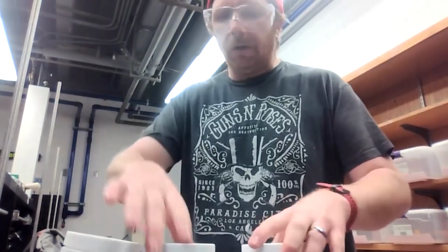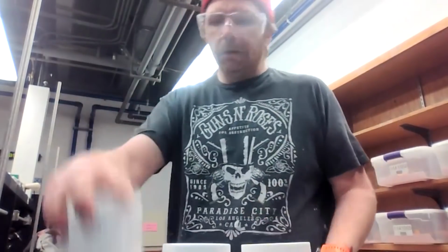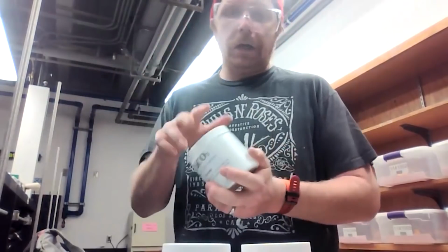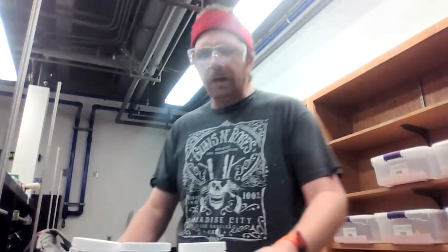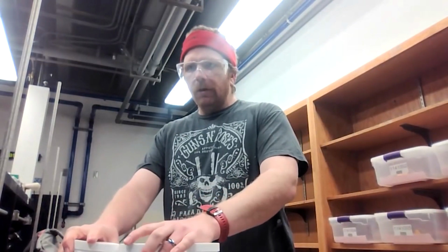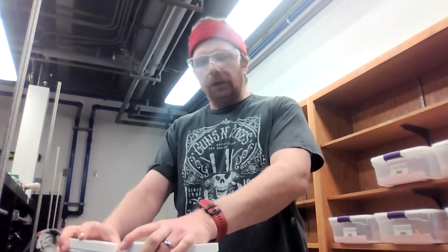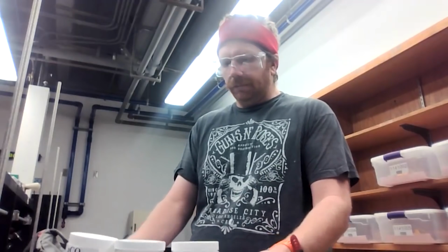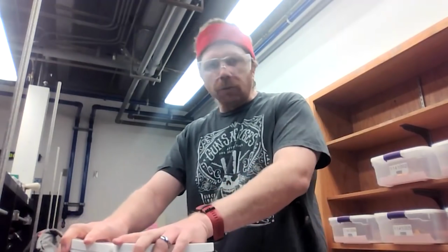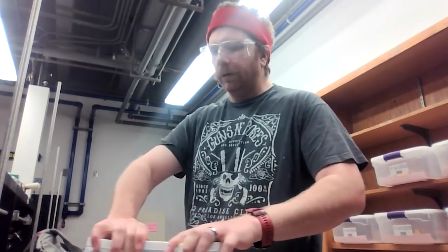They all have the same appearance, but if you were in the lab, you'd be able to recognize that these have slightly different densities. What I mean by that is this powder is much lighter than this powder, even though they fill up basically the same space. So that's one thing that makes them similar and one thing that makes them different from one another.